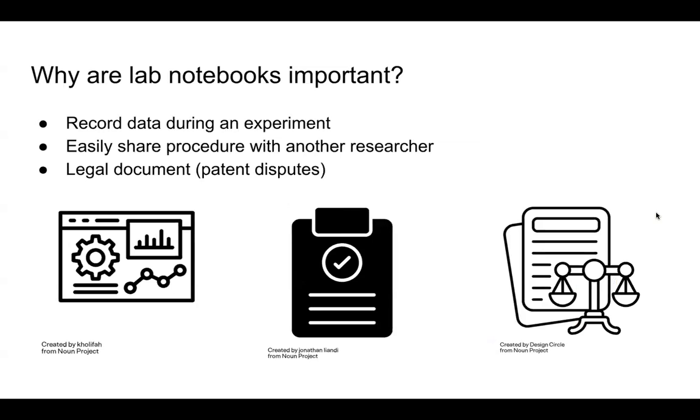Well, they're the place where you're going to record any and all data while you do an experiment. It is also a place to record your procedure in case you need to share it with another researcher. And if you create an amazing invention, a lab notebook is considered a legal document and is used to help settle patent disputes.